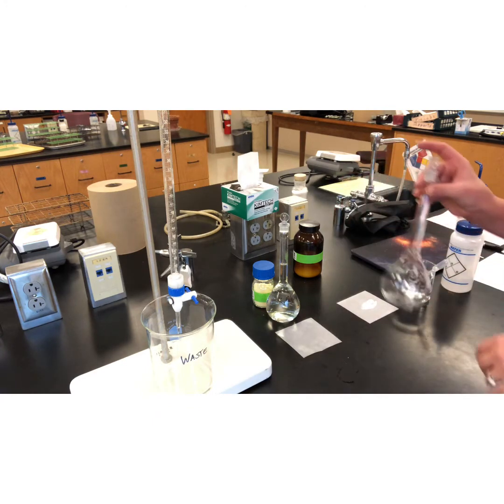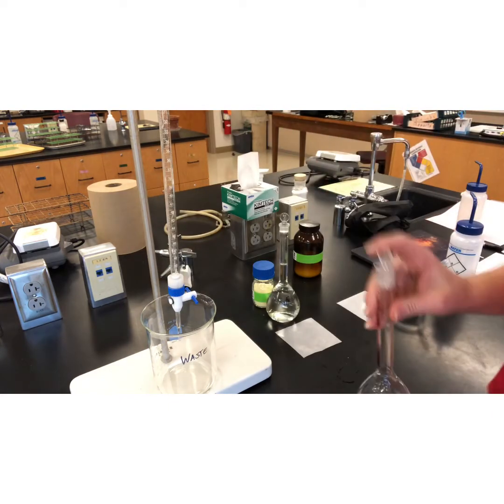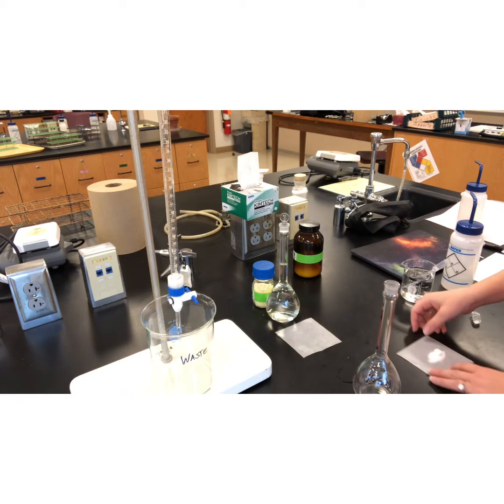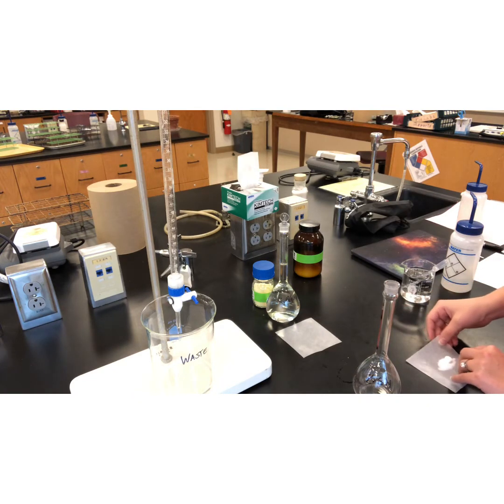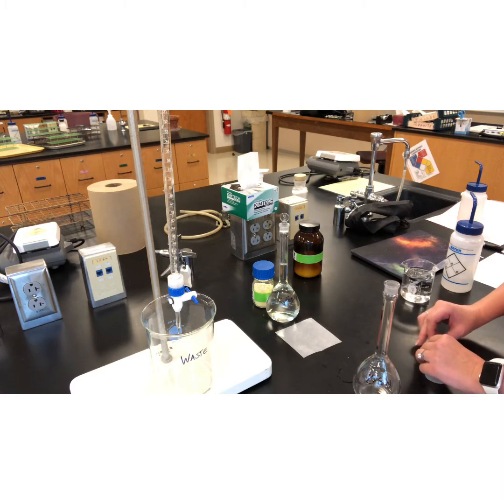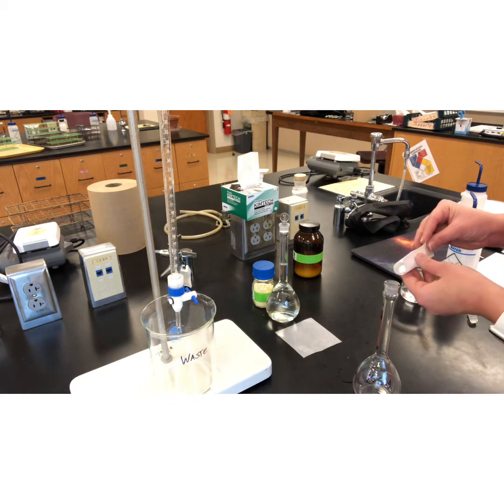And I'm going to use the same kind of glassware that I've labeled so I don't get the two mixed up later on. One is yellow. It's white or clear and colorless. I'm going to go ahead and wrap my weigh paper up, use it a little bit like a funnel. Or we could actually just use a funnel, might not be the worst idea.